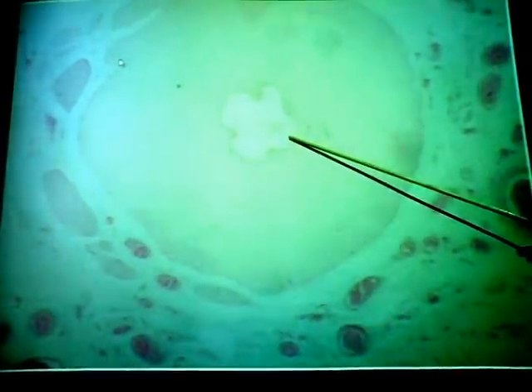Spermatic cord actually contains a lot of blood vessels, which we see here. It also has nerve fibers, which we see here. A lot of connective tissue as well. So it's like a cable, a bunch of wires. One of those wires, the prominent one, is the tube that actually carries the sperm. This is the ductus deferens, or vas deferens. Okay?